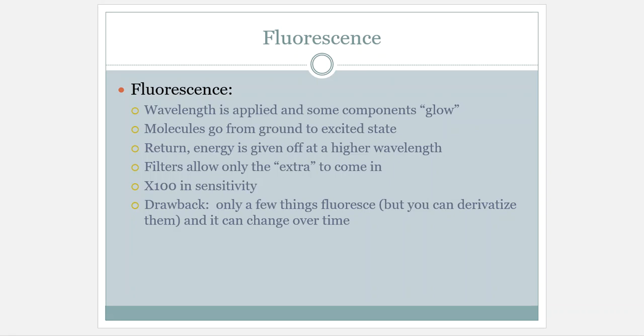So fluorescence is the idea that things are going to glow. That's what they're going to do. They're going to glow. All right. So this idea is that it's like a glow in the dark type of situation here. And this is great because, you know, sometimes that works. Sometimes it does not, though. And that's fine because some things respond very well to fluorimeters. Some do not. The ones that do, though, are highly sensitive, which is why a fluorimeter is actually so good.